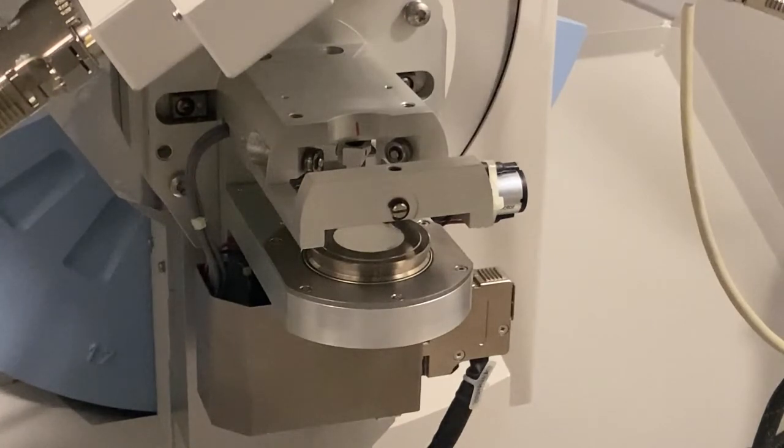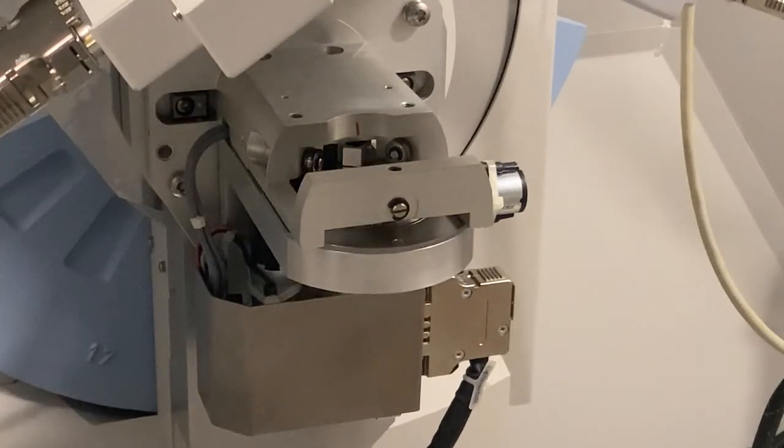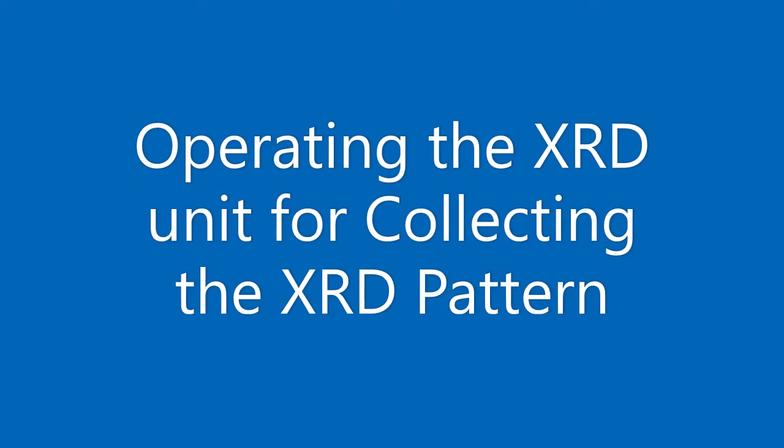Remember, in Bragg's law, the geometry is defined for a sample at a very specific horizontal plane. If the sample were above or below that position, then the diffraction angles would be different than in the schematic diagram we show for Bragg's law. And so the design of the sample insertion shown here is specifically set up to achieve the sample at that diffraction plane so that we can properly relate the incoming beam, theta, to the diffraction angle, 2 theta.